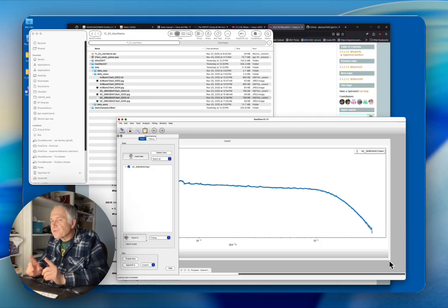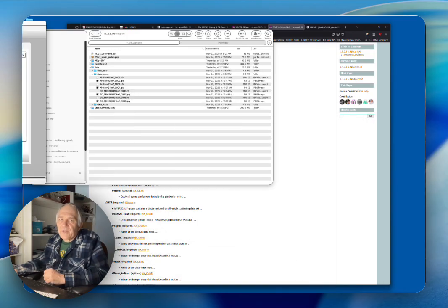That's not completely true if you need to change the default parameters, or if you have specific needs for different types of calibrations, or if you did not follow the proper instructions on the proper sequence of data collection, that you need to collect the appropriate blank first and last, before and after all the measurements of the samples. Then you may need to go and redo it in Igor if you didn't do something right, or if you need something else. But let's go further with this.